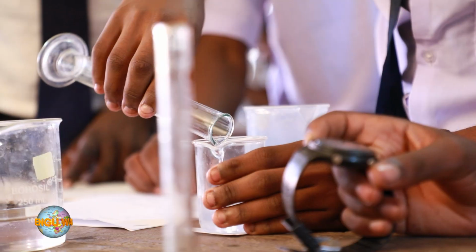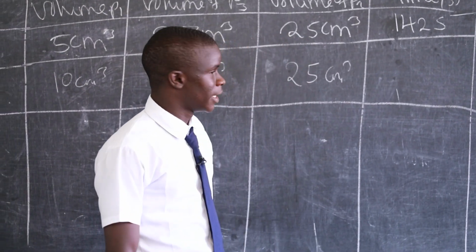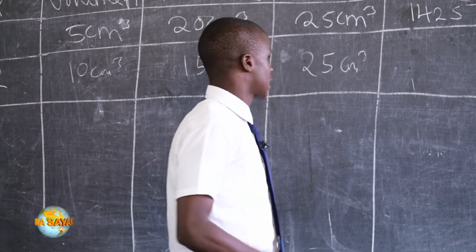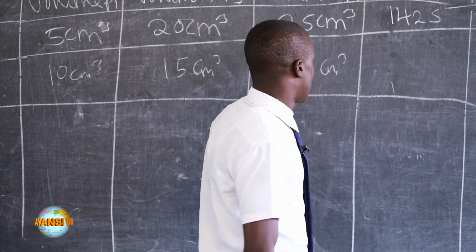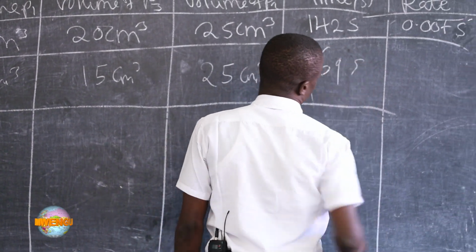After doing the experiment, we observed that the X disappeared, showing that the reaction had reached completion, in 69 seconds.